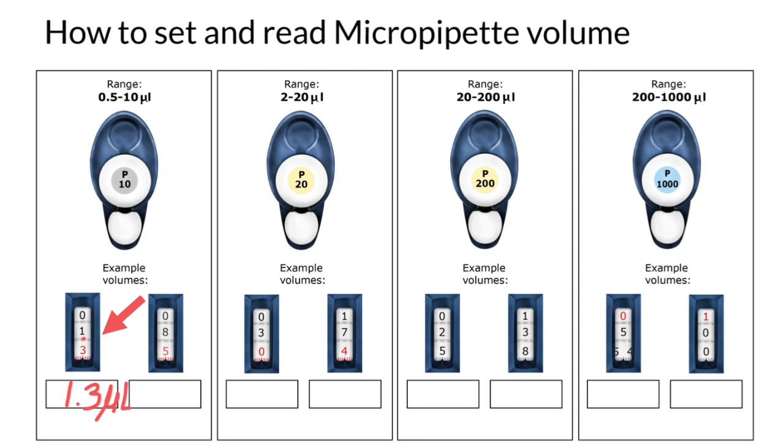The same is true here. It is not 85 microliters, it is 8.5 microliters.